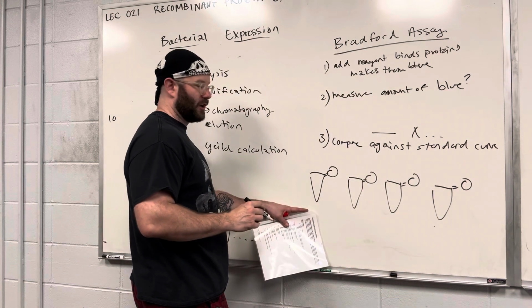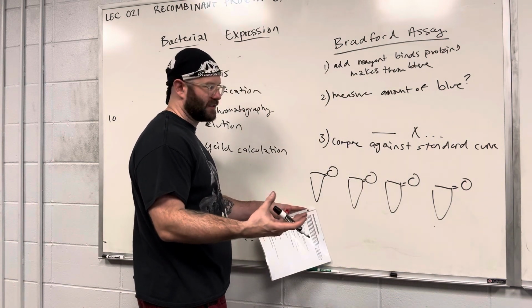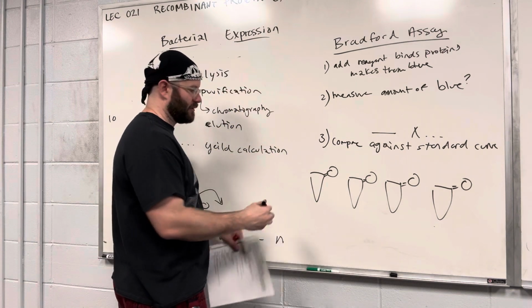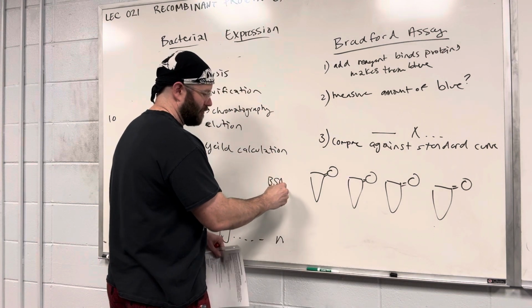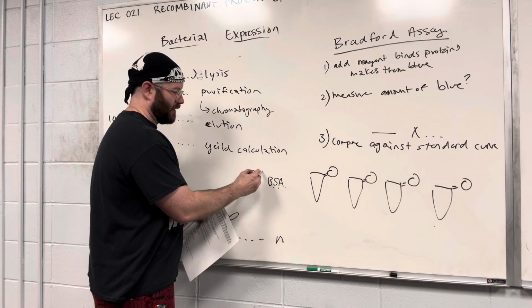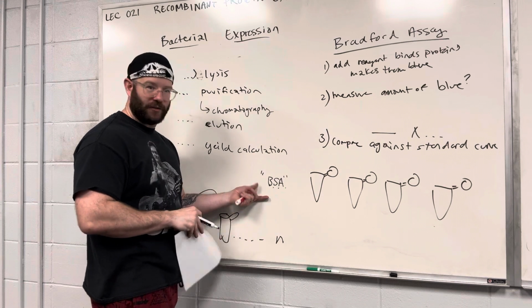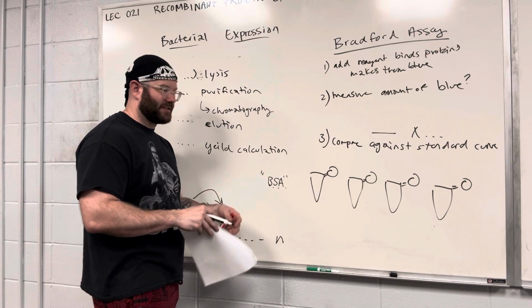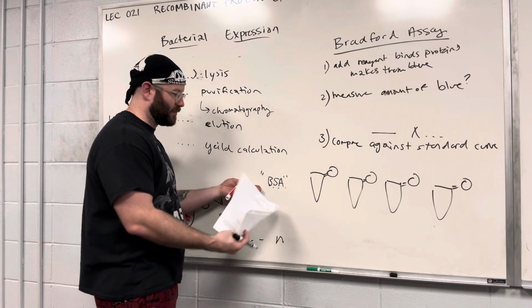And in this tube, you purchase some boilerplate protein. The boilerplate protein that people use is called BSA. BSA stands for bovine serum albumin. This is another one you want to memorize, you want to learn this. It's a very, very common molecular biology or biochemistry reagent. It's essentially just like if you want any old protein, you can use BSA.